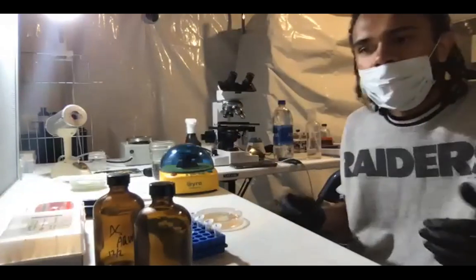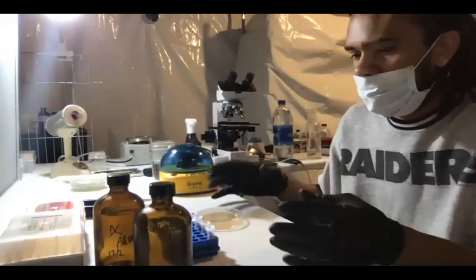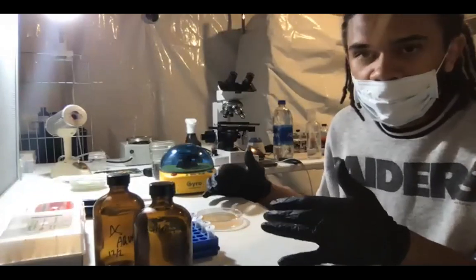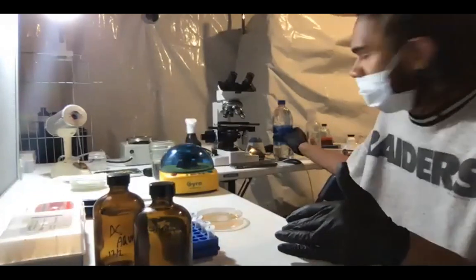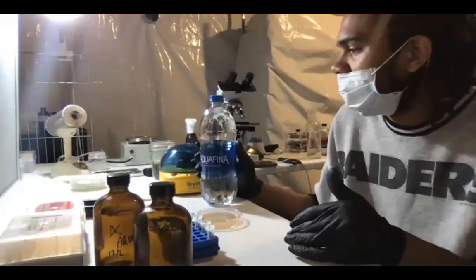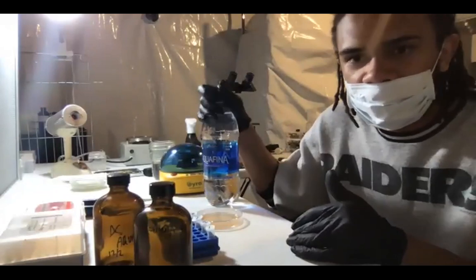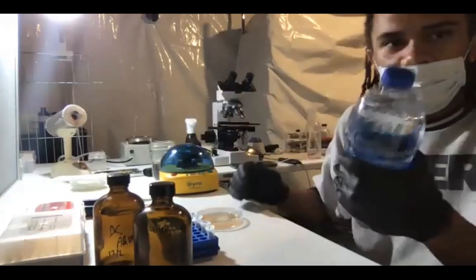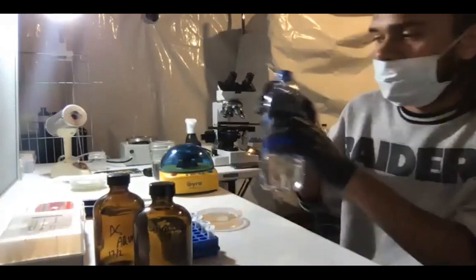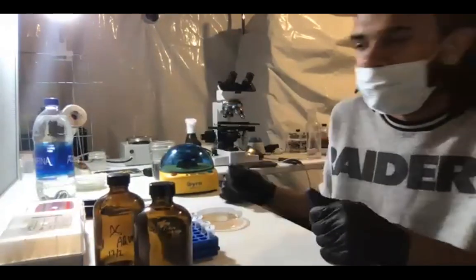And for a lot of the work that you're gonna be doing with molecular biology, you should order molecular biology grade water. But I found Aquafina to work really, really well, and I think it's kind of funny. But if you're gonna be running any things with Aquafina, make sure that you get a new bottle, because once you open it, then it's potentially gonna be contaminated with something.